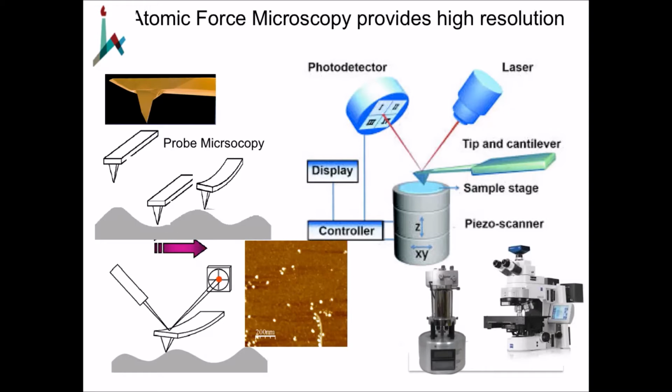And the integration with optical microscopy is exactly what I told you in the beginning: you don't have near-field optics, and you don't have what is called far-field optics, meaning the lens is far away from the sample. You have some combination that will give you much more than what the individual will.